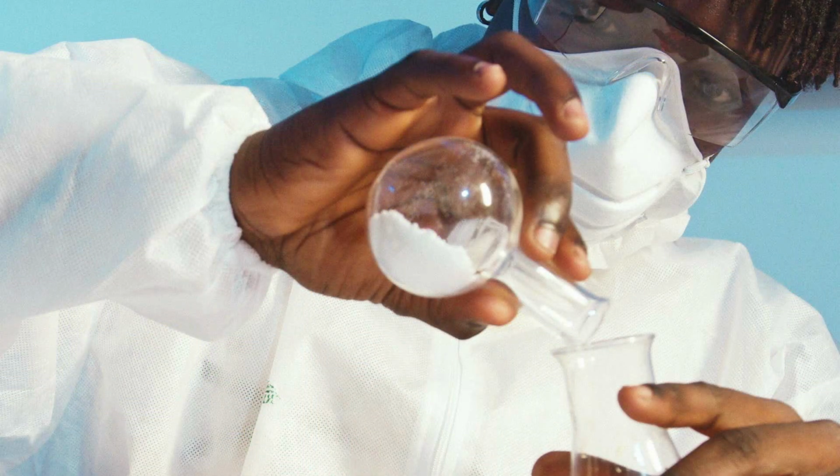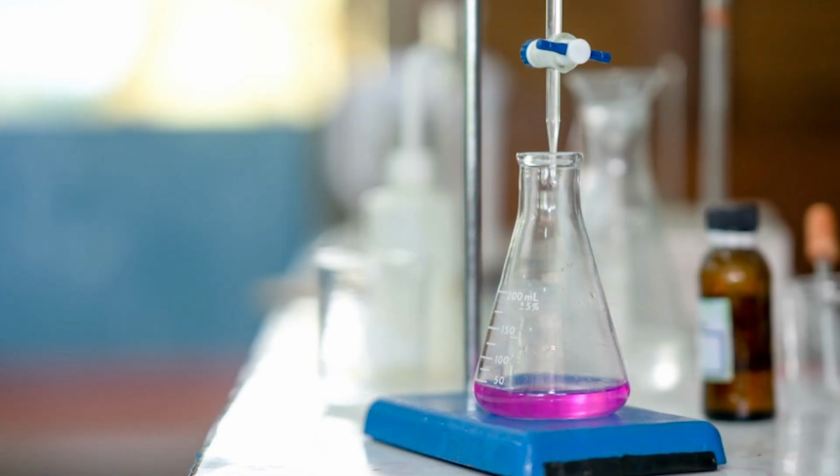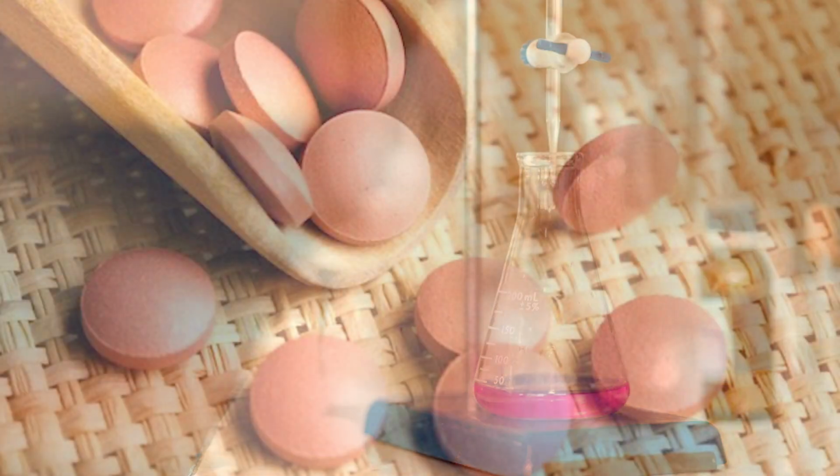As a high school student or even a chemist, titrating on a harder level is a necessary skill to know. In this video, I'll be attempting and most likely failing to perform a titration. The investigation being conducted is a redox titration to find the amount of iron present within each tablet.